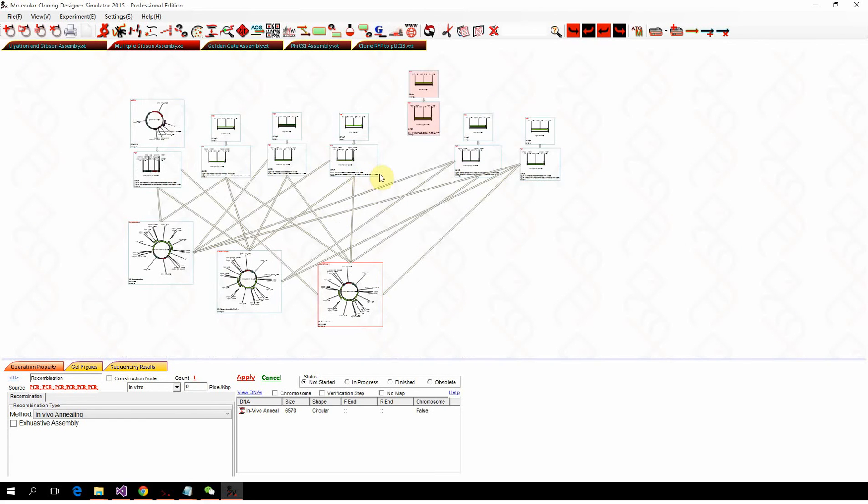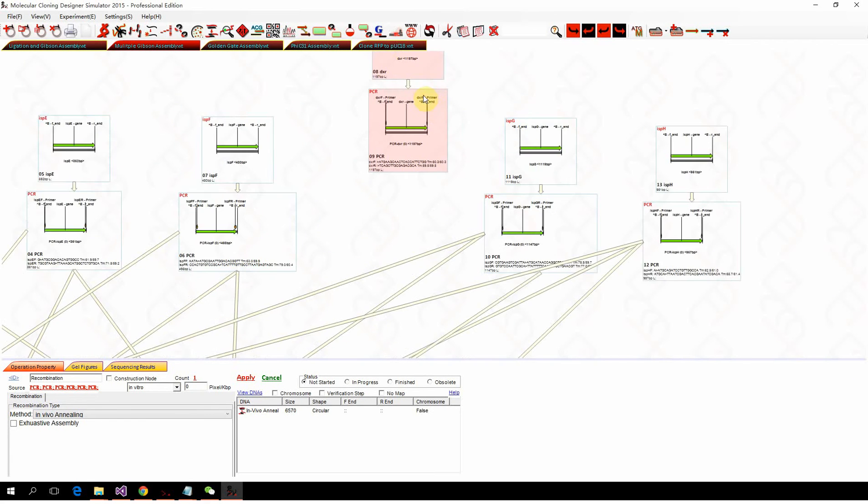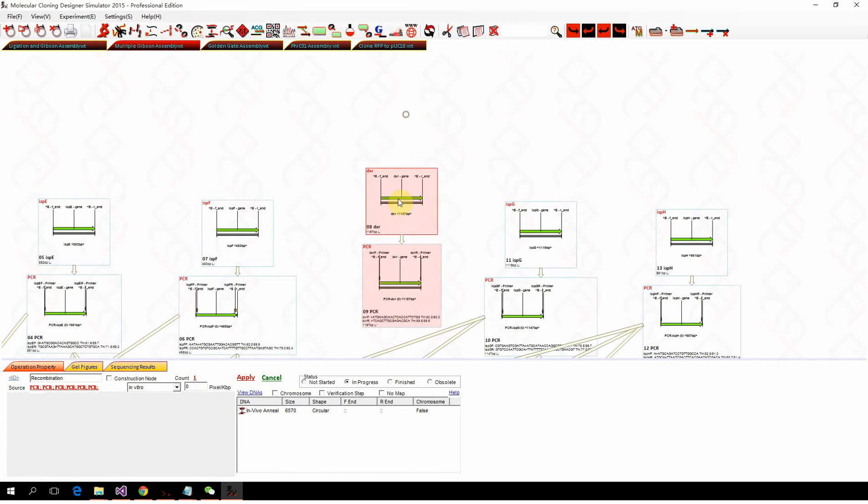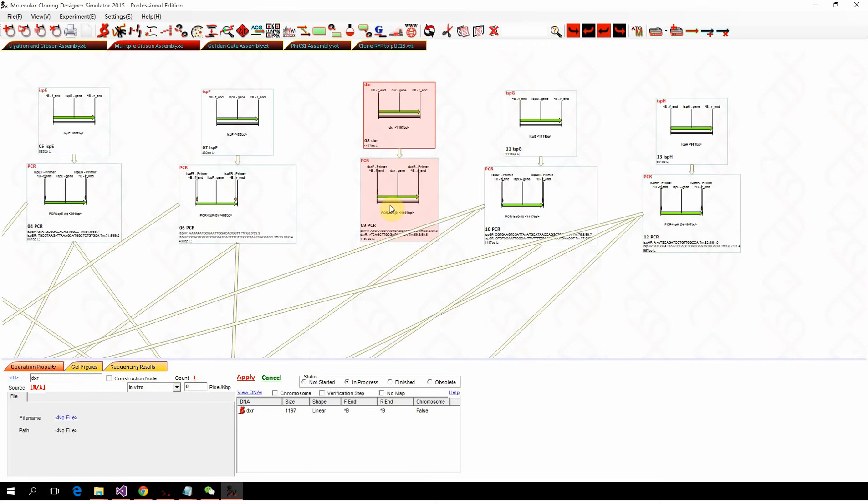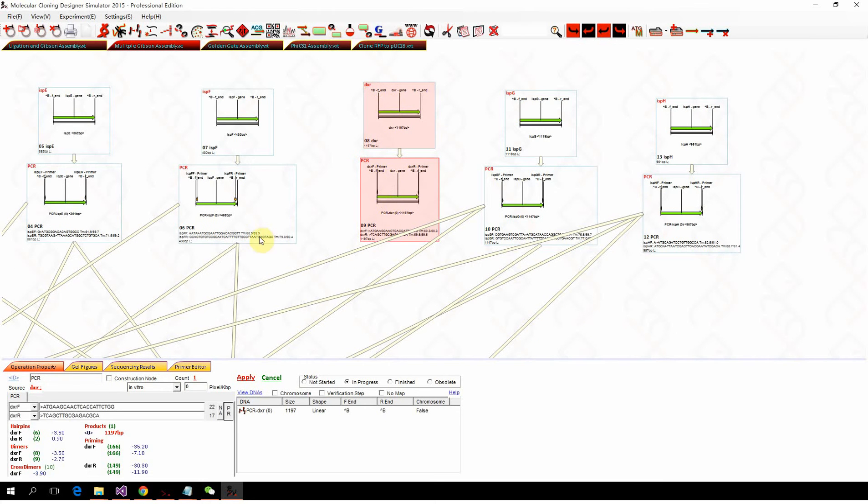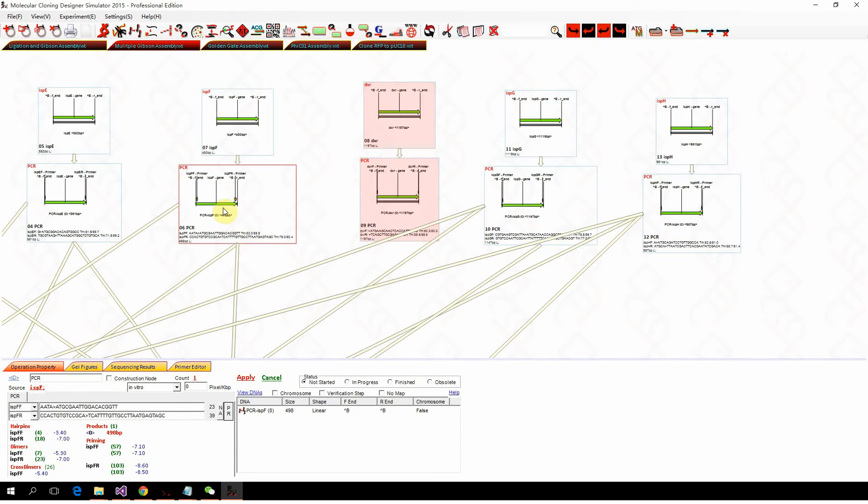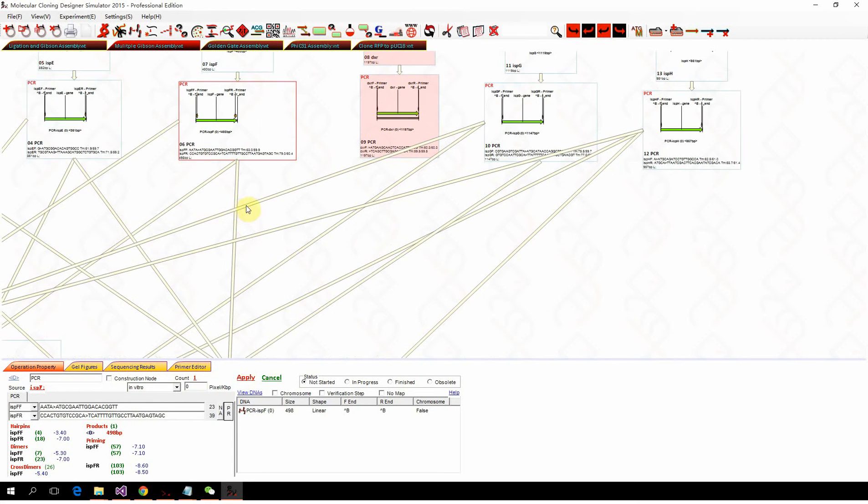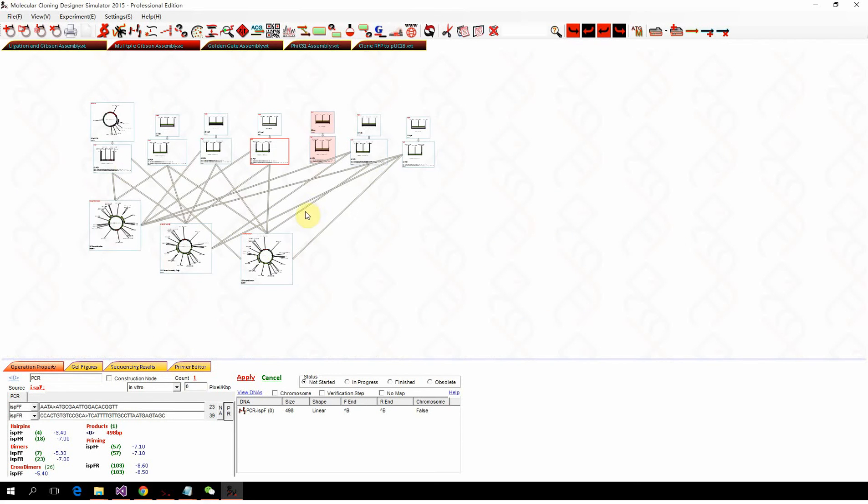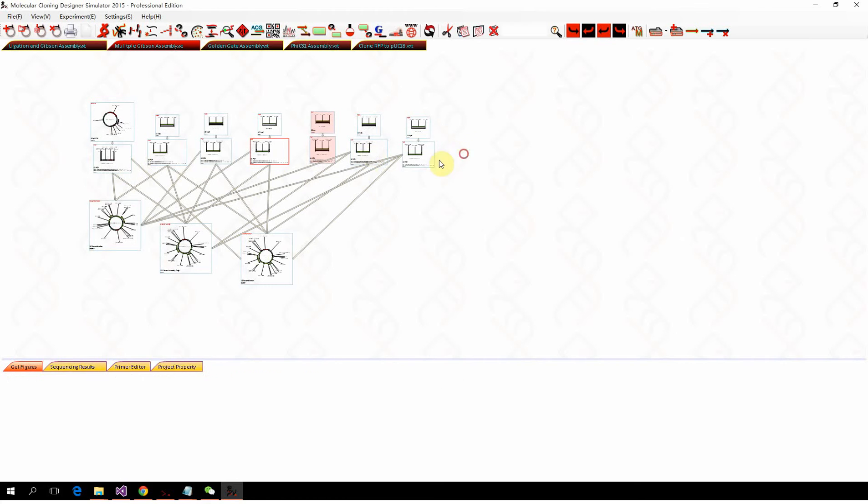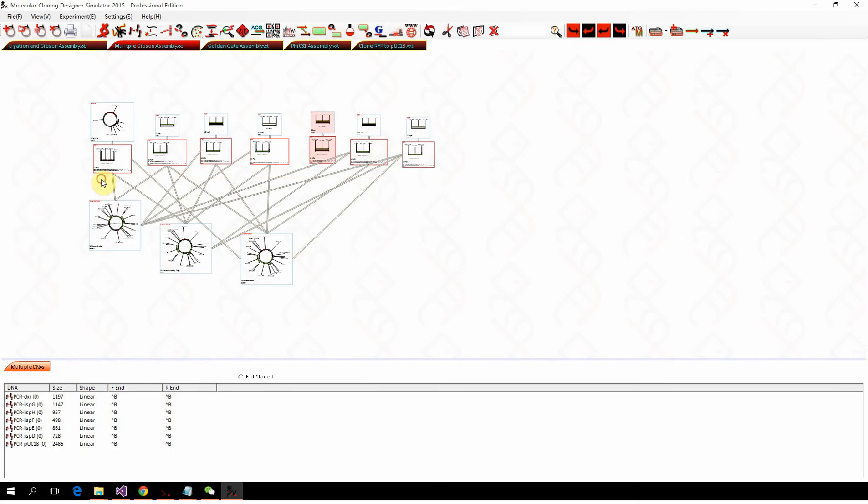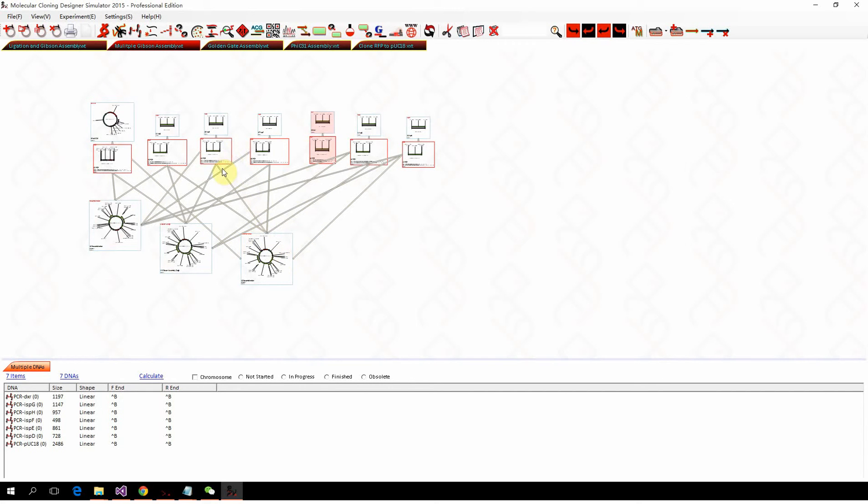However, if we add another fragment, this fragment has the same annealing ends of this one. If we add this fragment into the system, we can show that the Gibson assembly simulation will tell you your design won't work properly.